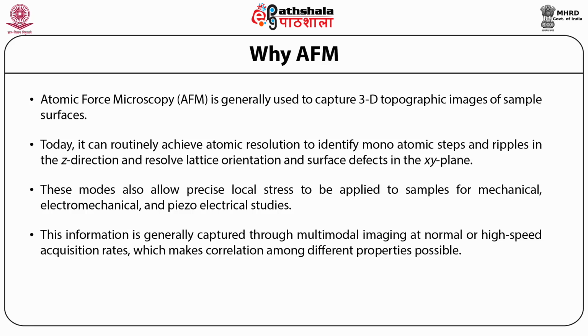In addition, AFM works not only under ambient condition but also in controlled environments including liquid, varied temperature, dry box, vacuum, etc.